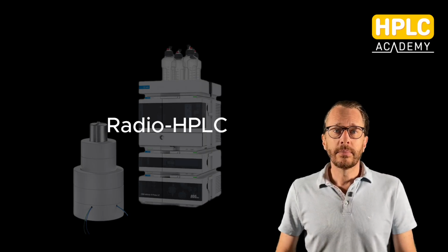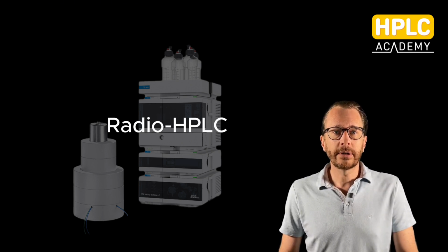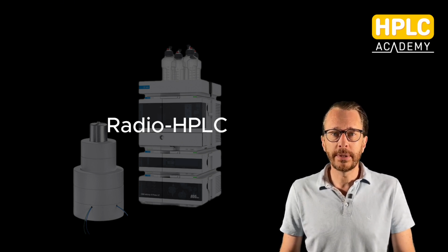In this video, you will learn what radio-HPLC is, where it fits in the radiopharmacy workflow, and why it's fundamentally different from normal HPLC, which you may already know from classical analytical chemistry.